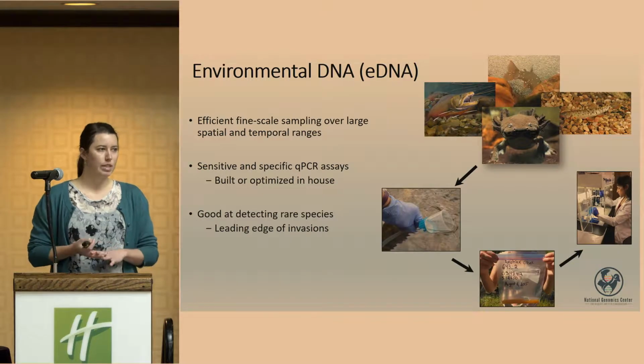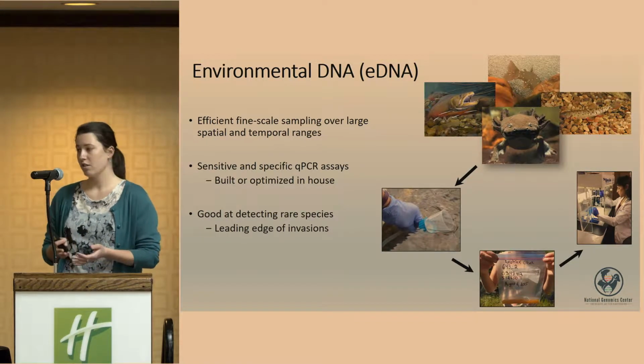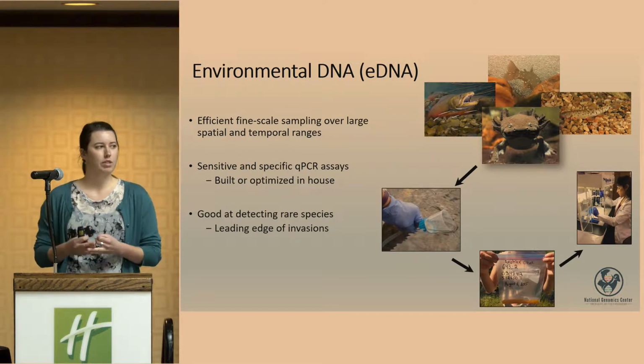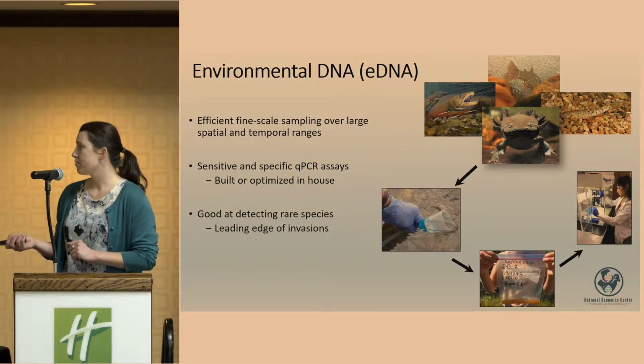At the National Genomics Center, we use sensitive and specific qPCR assays that are either built or optimized in-house. And like was also just mentioned, because these assays are sensitive and specific, they can be really good at detecting species that are rare on the landscape. So this also includes the leading edges of invasions.